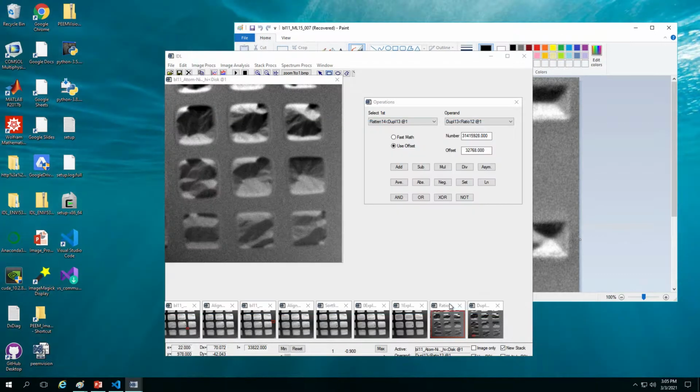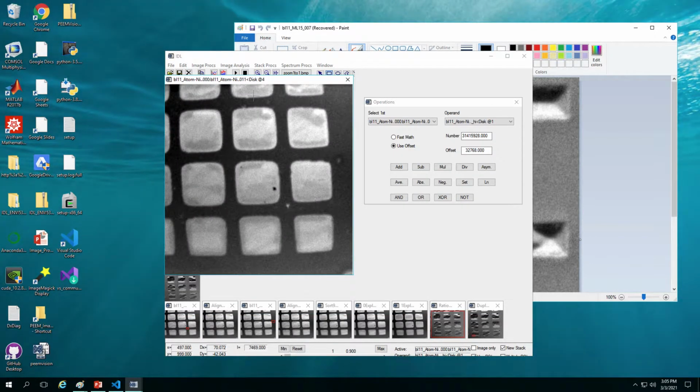Okay, so that's saved. By the way, when we are saving those processed images, you might also want to save a version as Tiff, not just JPEG. So we have two of them, because Tiff is lossless. When we use it for future processing, we don't need to repeat this whole process again. Okay, let me show you quickly.